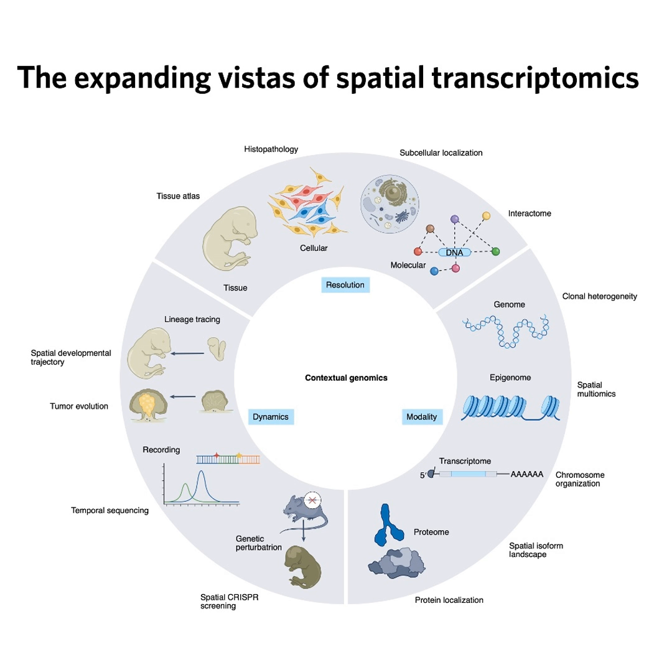I know you mentioned sequential rounds. There's a simple approach of labeling some, imaging, stripping off the probes, labeling others. But that only gets you so far, right? Maybe 100 genes before the sample falls apart. Exactly. That sequential stripping approach has scalability limits due to sample degradation.